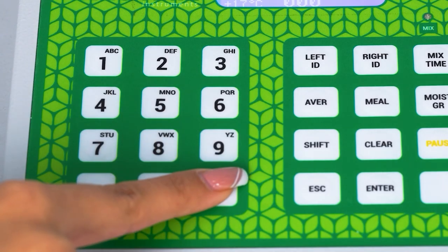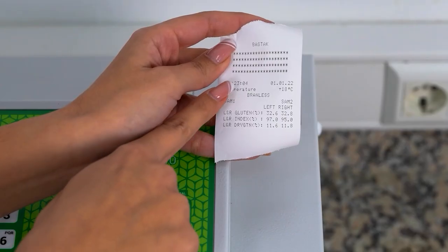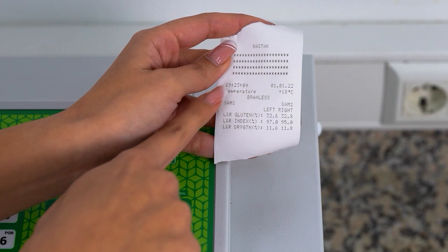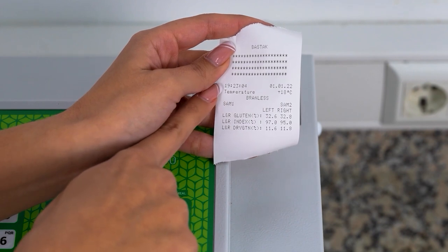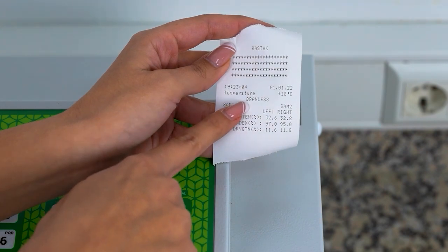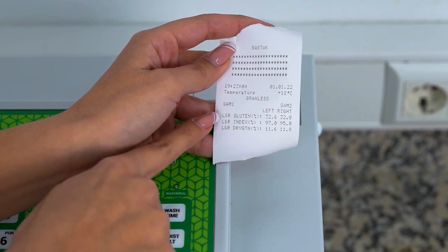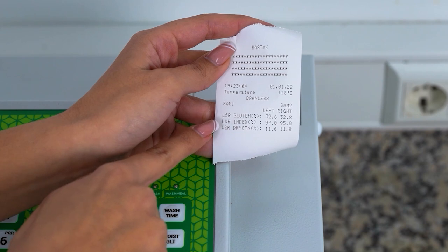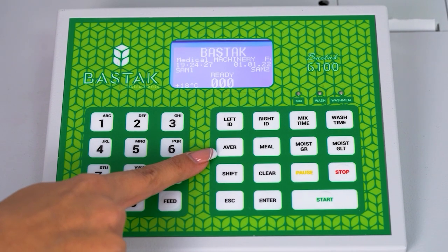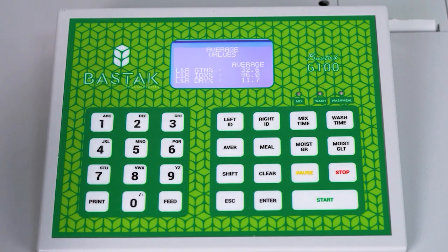By pressing the feed button, the output length of the paper is extended in order to tear off the printout more easily. The printout shows company information on the upper part, the time on the left and date on the right in the second line, ambient temperature in the third line, sample type in the fourth line, left and right sample names in the fifth line, and wet gluten, gluten index, and dry gluten values in the sixth, seventh, and eighth lines. When it is desired to take the average of the obtained values, the average values can be seen on the device screen by pressing the average button after the recording process.